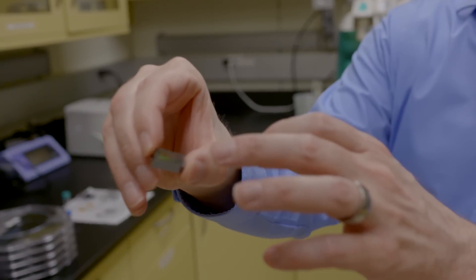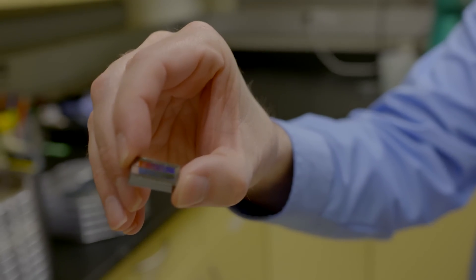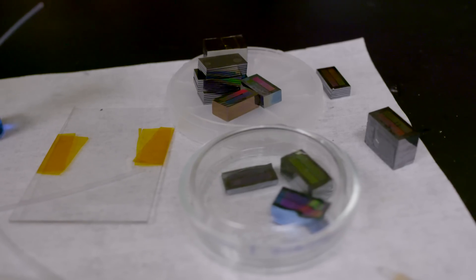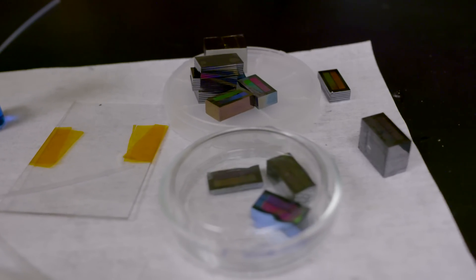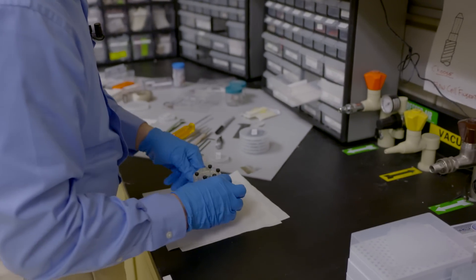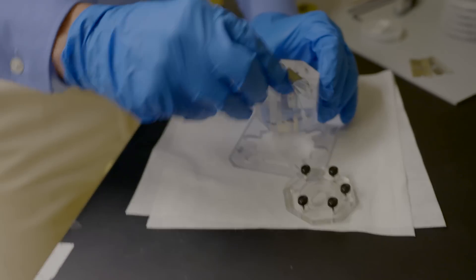This is one of the chips that we've made here in a stack configuration where we've actually bonded the chips, and we've got several large-scale nano DLD arrays that we've created. After we've fabricated the chips and diced them up, we need to mount those — we need a way to interface with the outside world.